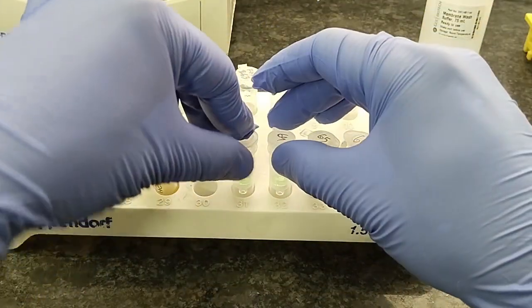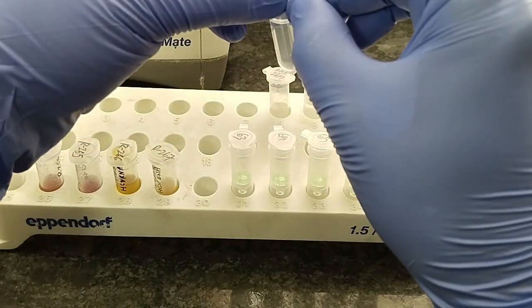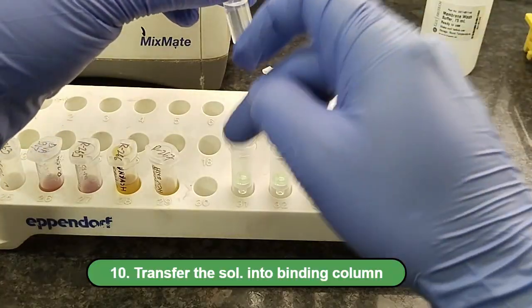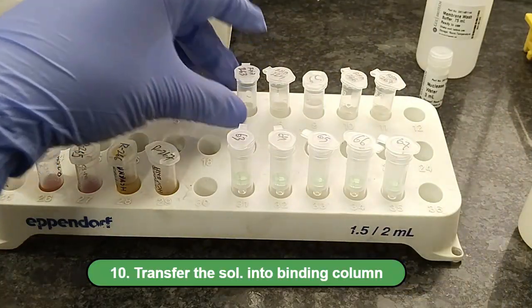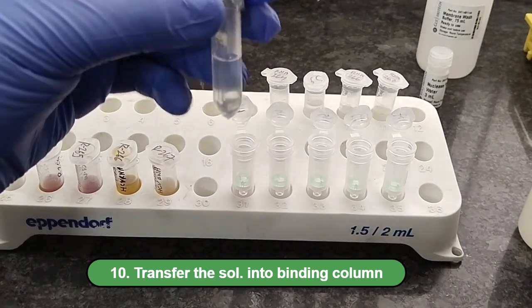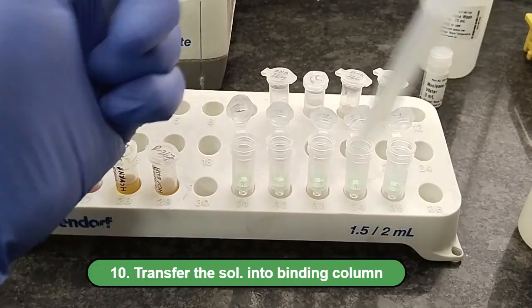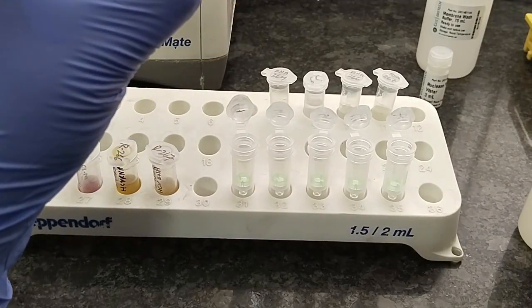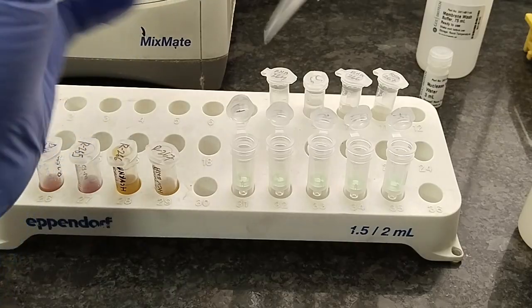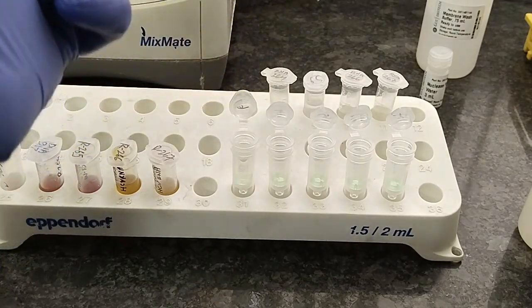Now we need to load 700 microliter of supernatant to the RNA binding column from each tube.